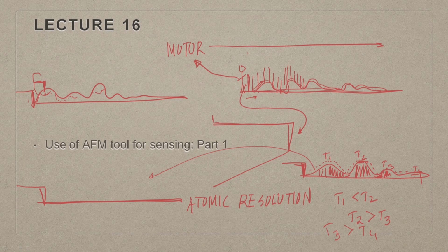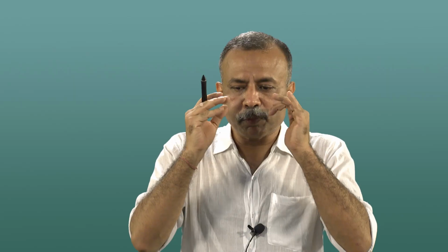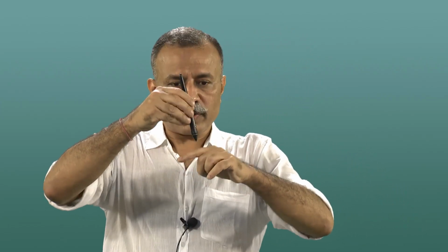So that brings us, as we will be proceeding, there are multiple ways this tip can be changed, or this tip conformation can be altered, because this tip conformation can bring a whole lot of independence and degrees of freedom for the user while you are working with AFM. So, it is very important that you try to push your imagination to the maximum level of what all it can do, because there are surfaces, and again there are molecules which can absorb vibration, because mind it, you have a tip going and it is hitting the atoms. So, it itself will create some kind of a disturbance in that. That may even create vibrations out there.